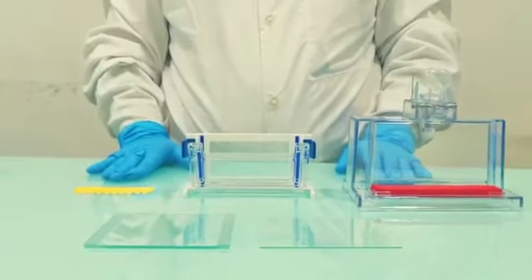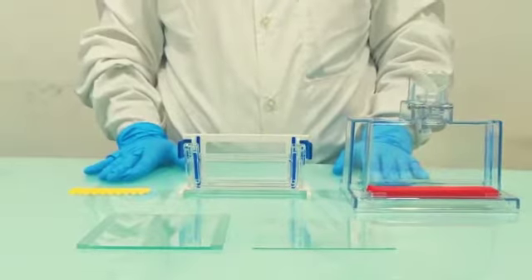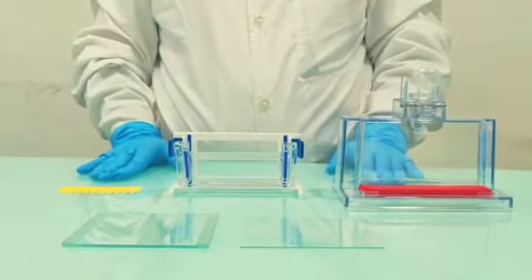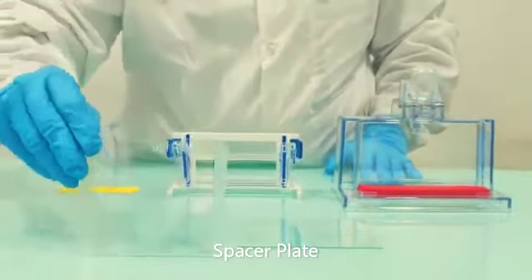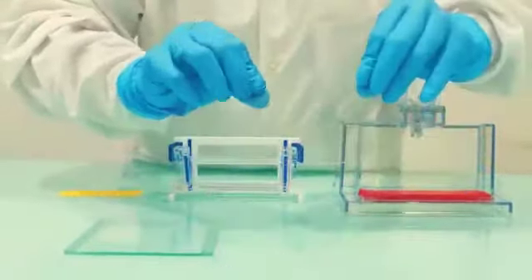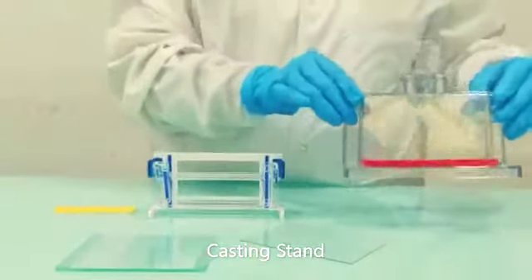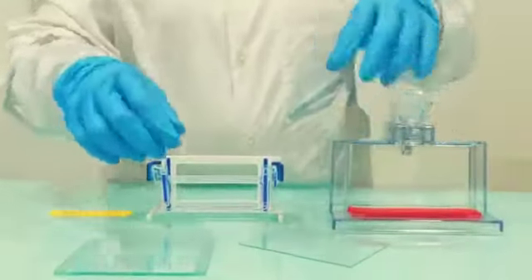Hello everyone. Today I will be showing how to cast SDS-PAGE gel. The apparatus required to cast the gel are spacer plate, short plate, casting frame and casting stand.